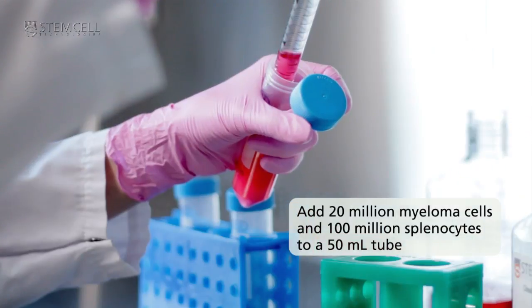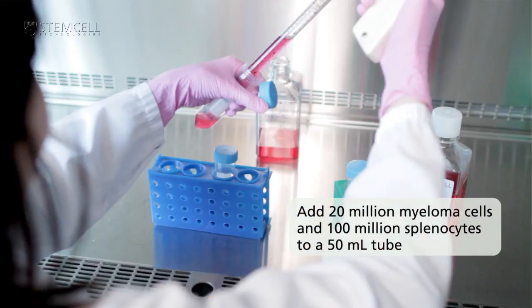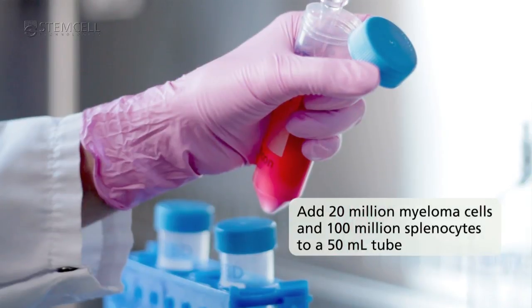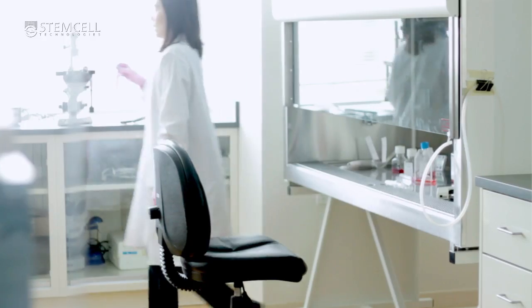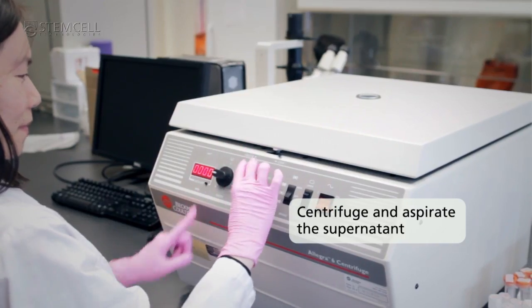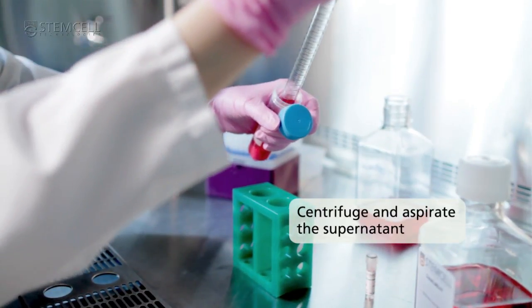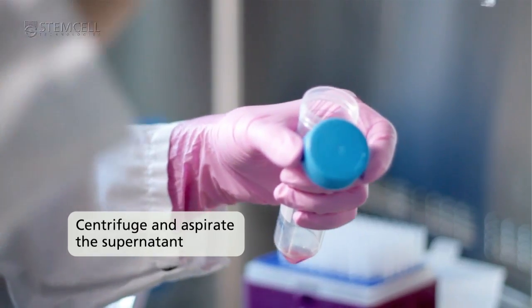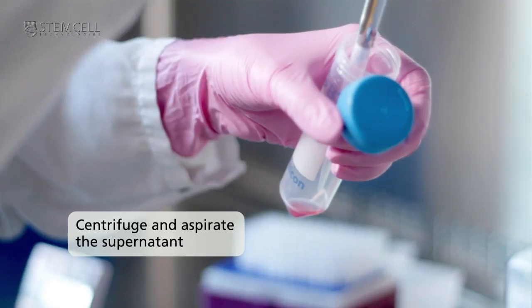Add 20 million parental myeloma cells and 100 million viable splenocytes to a 50 mil tube. Centrifuge and aspirate the supernatant. It is important to completely remove the supernatant to avoid diluting the PEG that will be added.